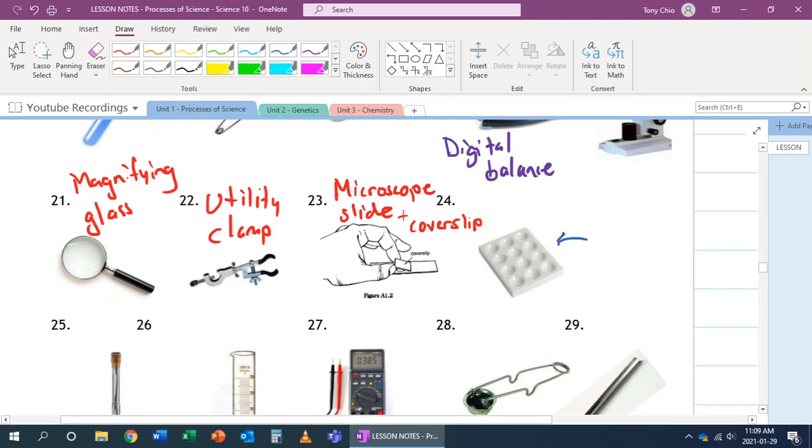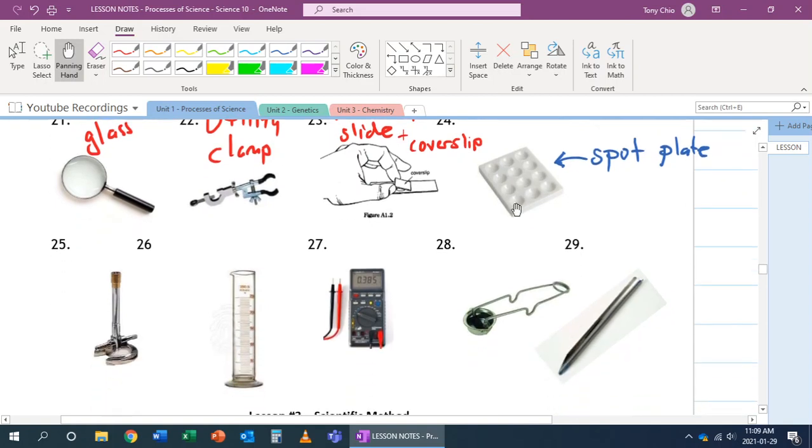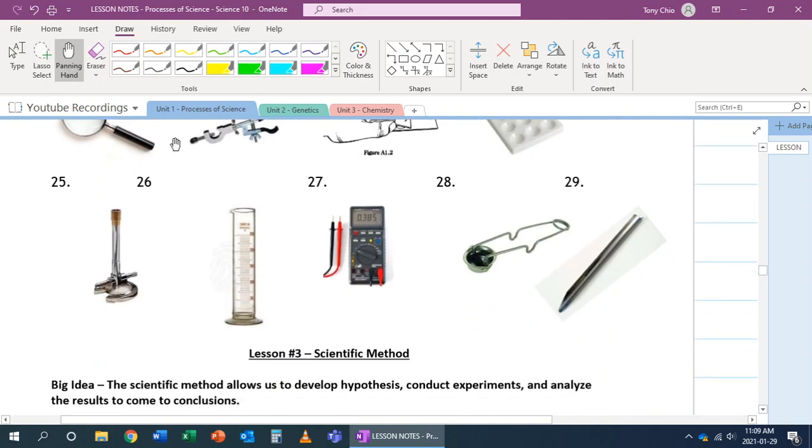Number 24. That is called a spot plate. Each spot is very tiny, but you can mix two solutions, for example, in there and see what the results are. So it allows you to see, in this case, 12 different experiments of mixing something in it. Number 25. That's our Bunsen burner. So this is now heating something up with a flame.